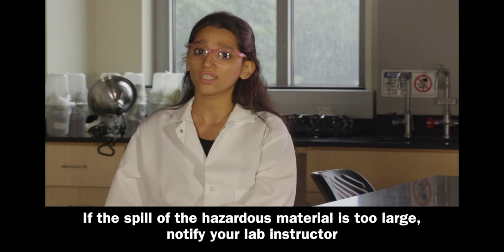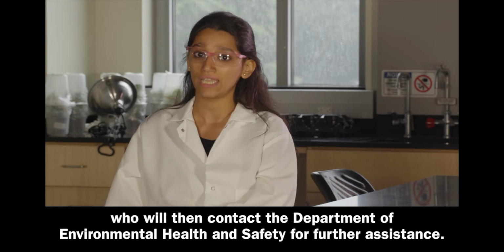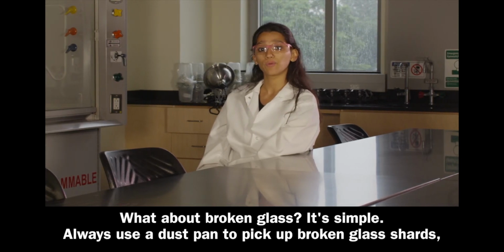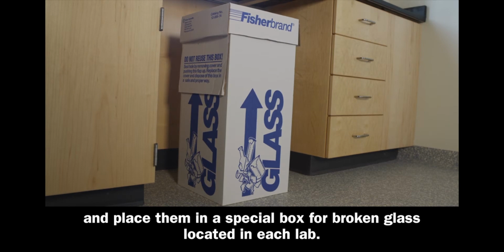If the spill of the hazardous material is too large, notify your lab instructor, who will then contact the Department of Environmental Health and Safety for further assistance. What about broken glass? It's simple. Always use a dustpan to pick up broken glass shards and place them in a special box for broken glass located in each lab.